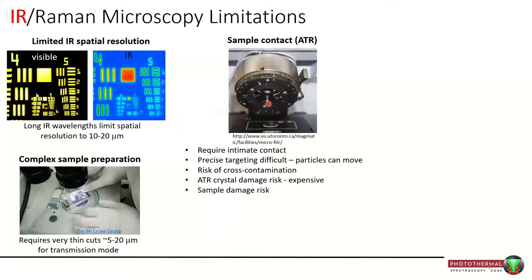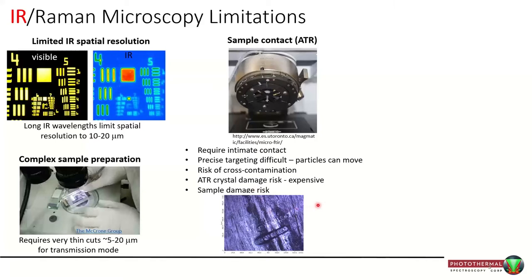The ATR accessory goes some way to addressing some of these issues, but it requires intimate contact, precise targeting is difficult, and if you have particles, touching them with the crystal can make them move. There's risk of cross-contamination as you move from point to point, risk of crystal damage — they can be easily scratched and are expensive to replace — and risk of sample damage or indentation, as you can see from the marks left as the ATR tip scans across.